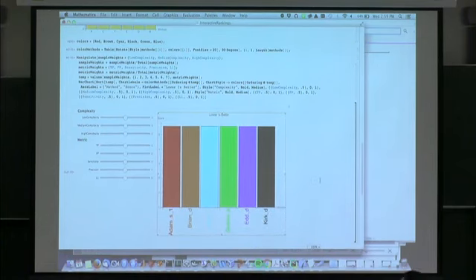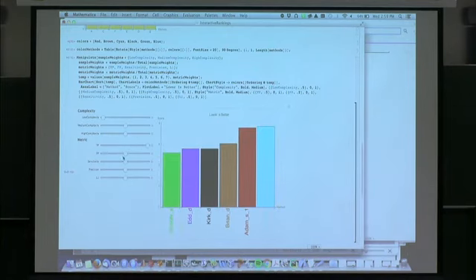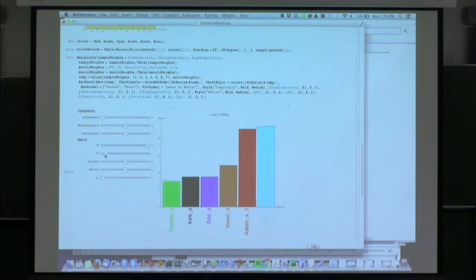I think what would be great is, so you can have, oh, what kind of complexity? Do you want to perform better on low, medium, or high complexity? You can say, you know what, I really don't care about low complexity because I'm doing soil samples or something like that. So I'm going to go ahead and drag this thing all the way down. You can see the methods change and say, I really care about getting high true positives, and I don't care about getting my abundances correct, and I don't really care about false positives. And they say, well, you know what, you can pick from these methods right here. These are best. And don't pick any of those methods.